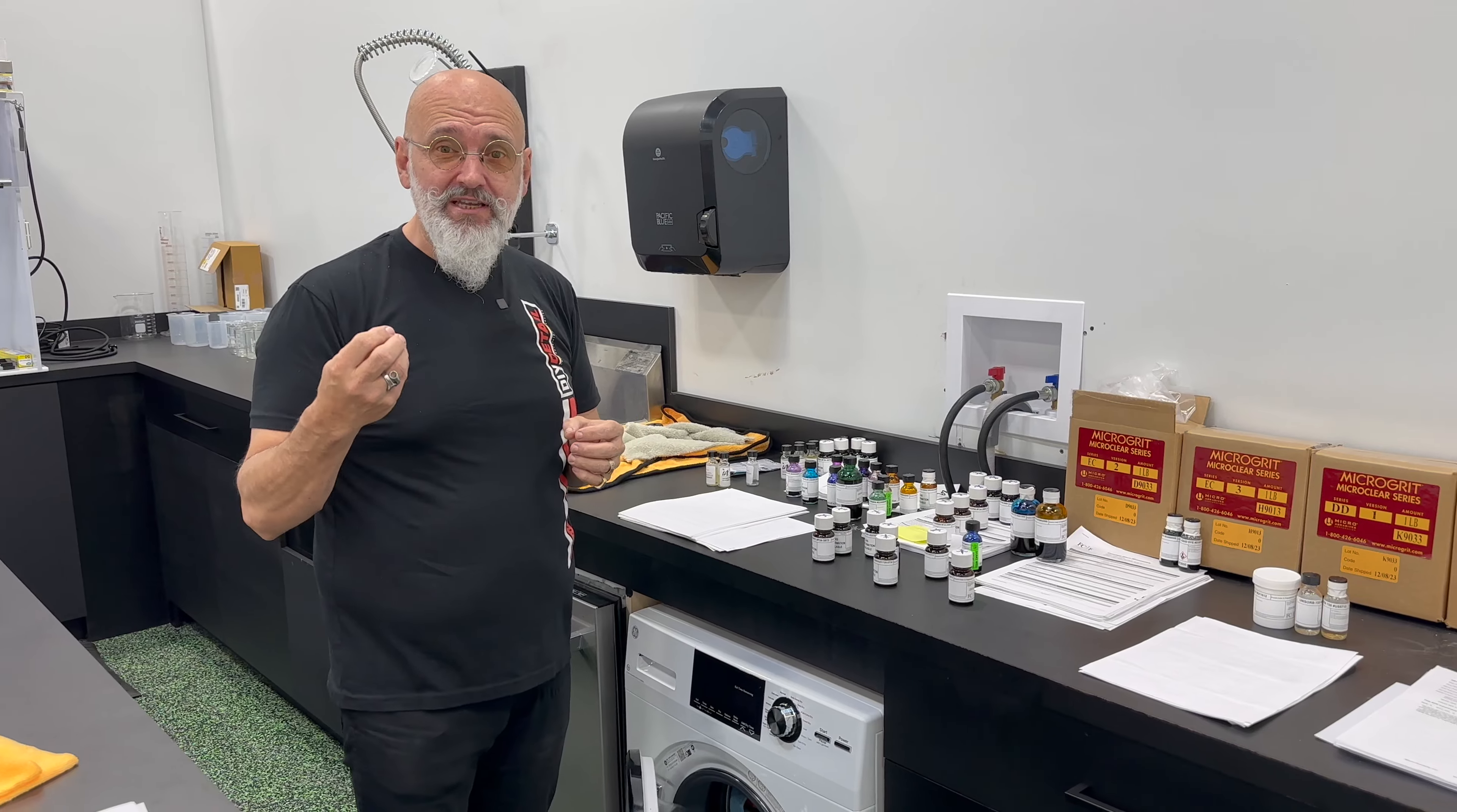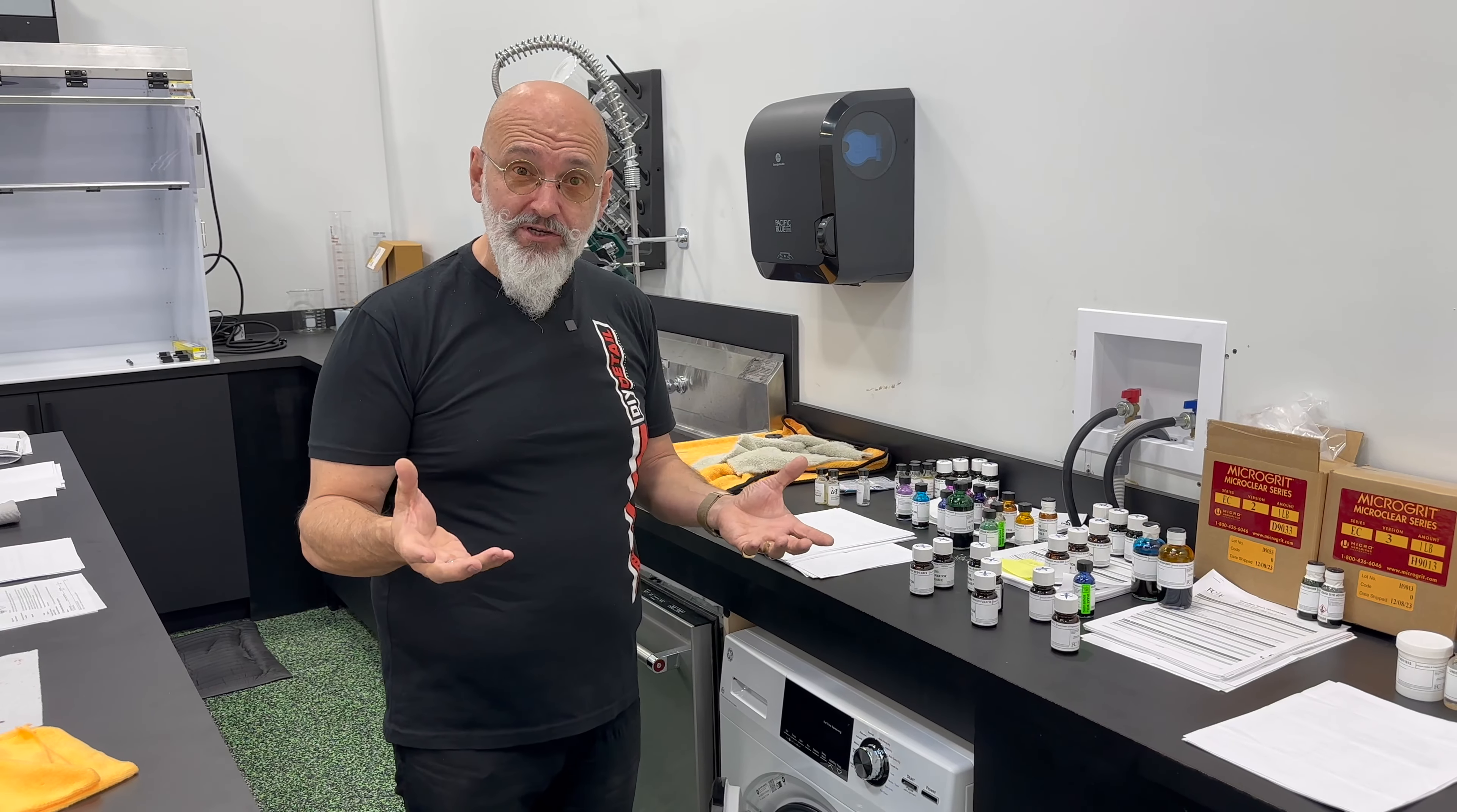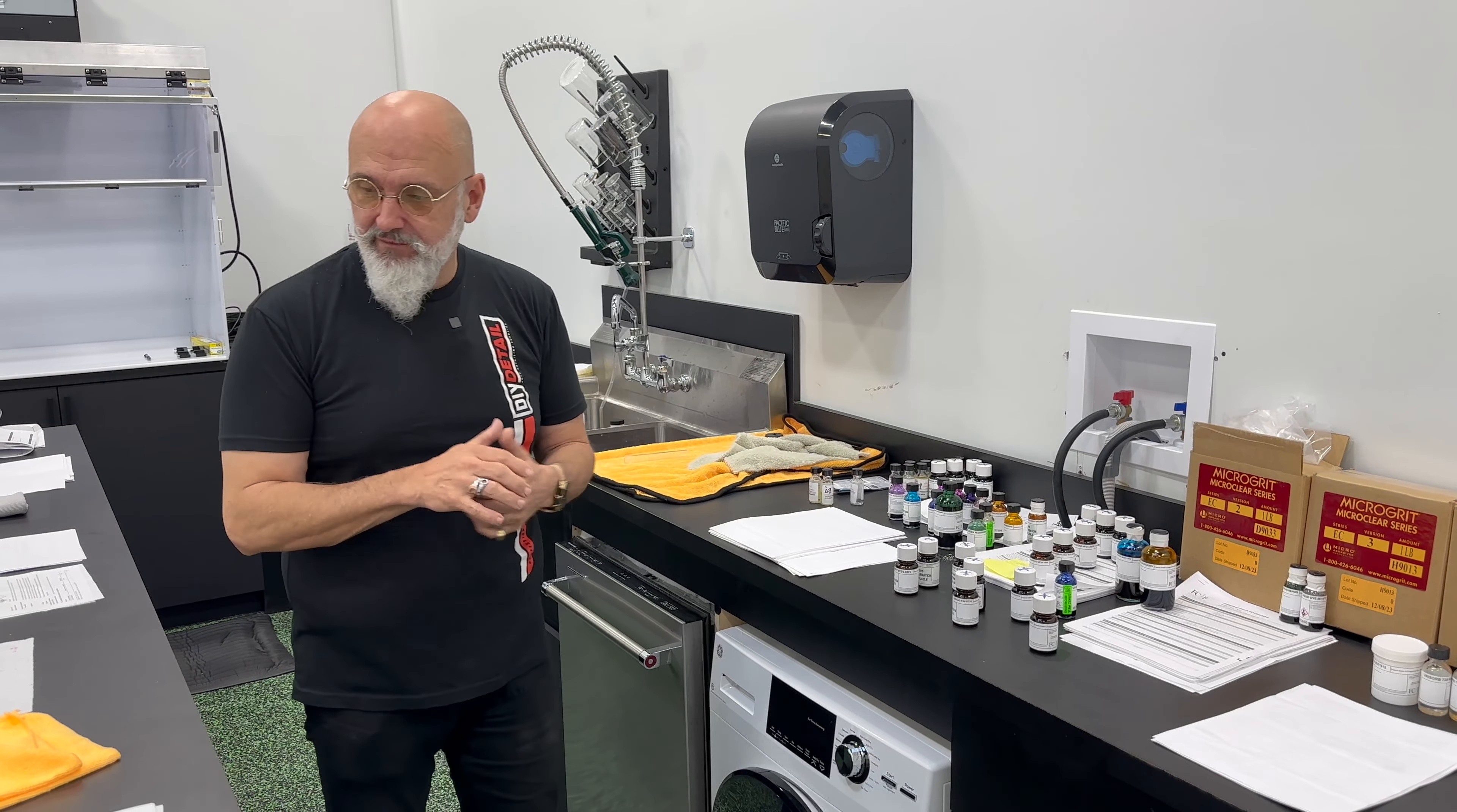And when we're mixing products, we need to make sure that, for example, the color or the fragrance isn't going to cause separation of the product, isn't going to break anything down. So that's an important part of it, having the proper things.